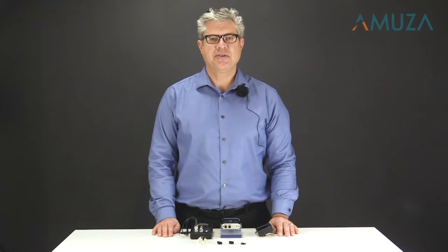Hi, my name is Mike Churchill and I'd like to introduce the Teleopto wireless optogenetic system from Amuza.